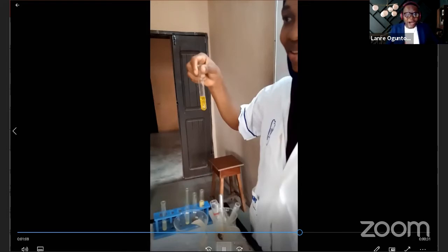So if you add potassium dichromate, having a yellow or orange color, to your alcohol, it could be primary or secondary, and the color changes to green or greenish. It may not be entirely leaf green, but it's going to change towards green. That tells you that your potassium dichromate has been reduced in the process of oxidizing your alcohol.